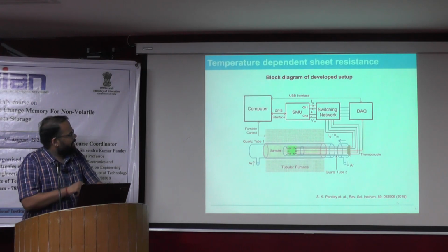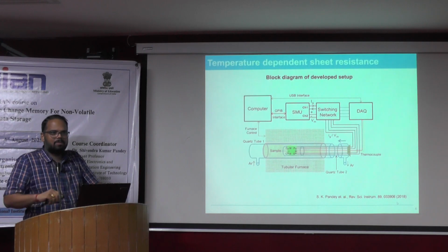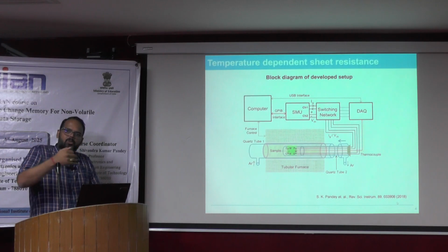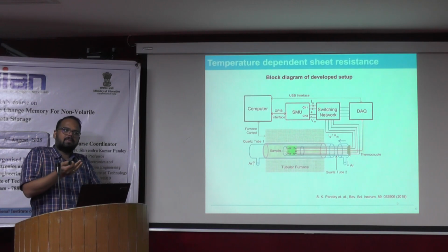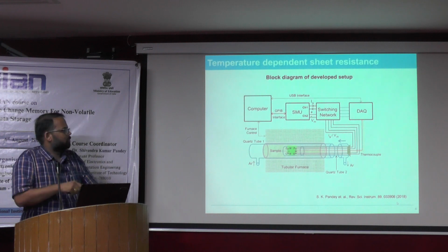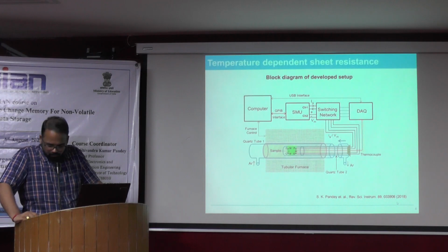And this whole thing is fully automated by computer, because you need to do in situ measurement. You are heating the sample, and simultaneously you are identifying the resistivity also. So this is the overall way by which we can see this.